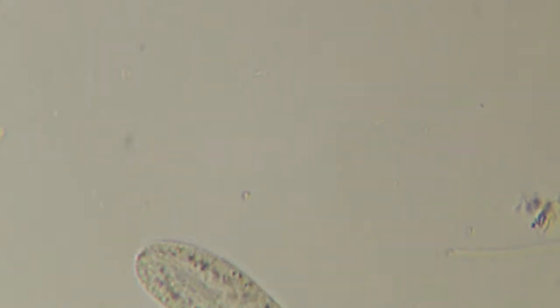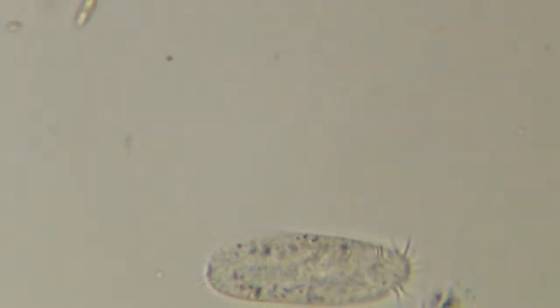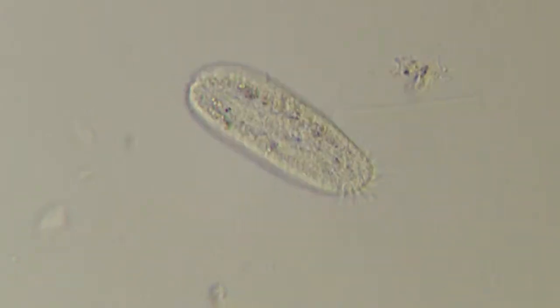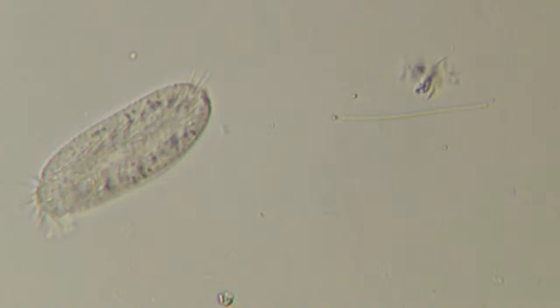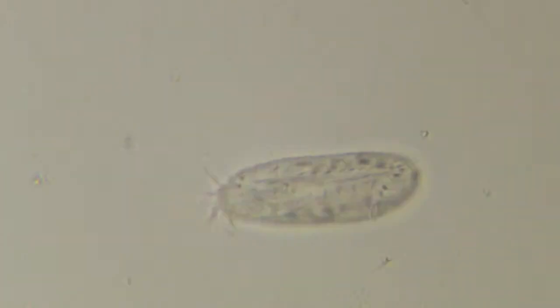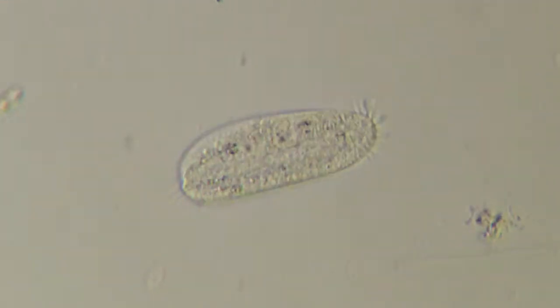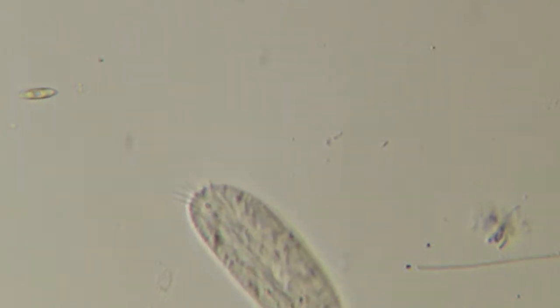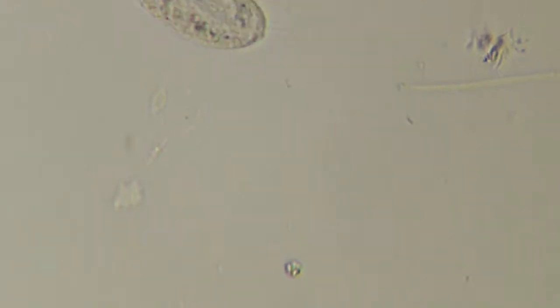It's got this really jerky motion too. I've seen this species do this a lot. It's a weird jerky motion while it's turning. It's like it's unsure. So kind of like the Vorticella backs off, but on a coil, this one keeps exploring, but it's timid a little bit. It backs off. So you get this weird jerky motion while it's rotating. Another diagnostic I've noticed on these guys. Yeah, come on. There we go.